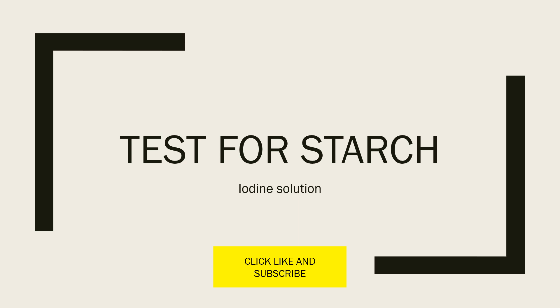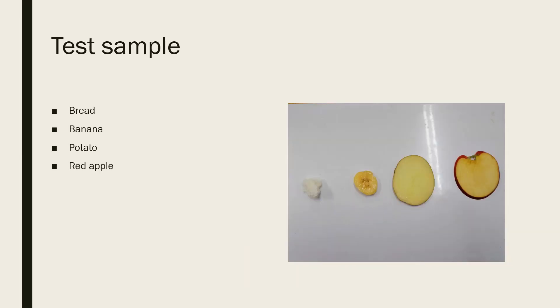Test for starch. Our reagent or solution that we are going to use is iodine. The substances or test samples that we are going to test are bread, banana, potato, and red apple.